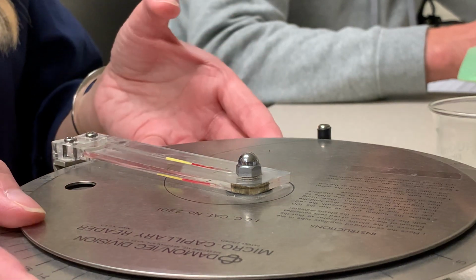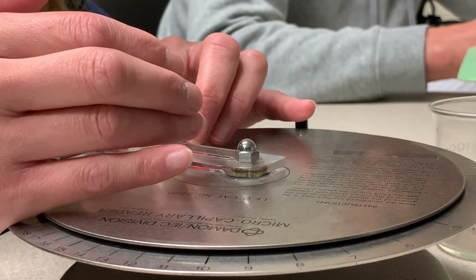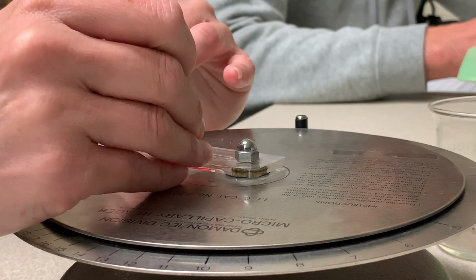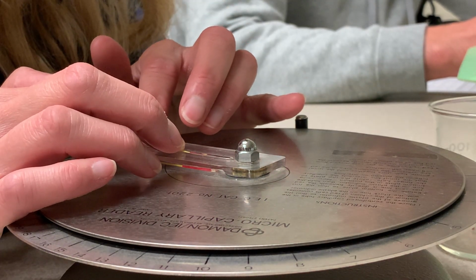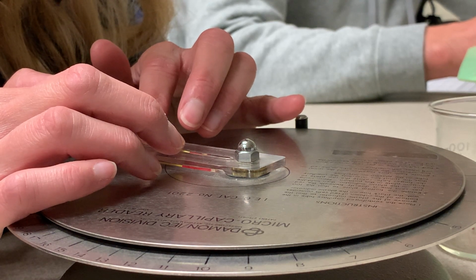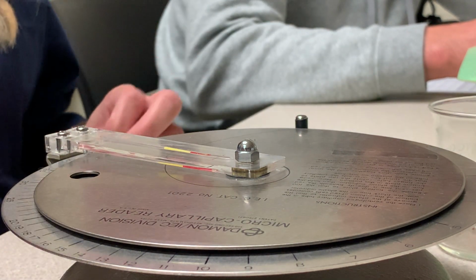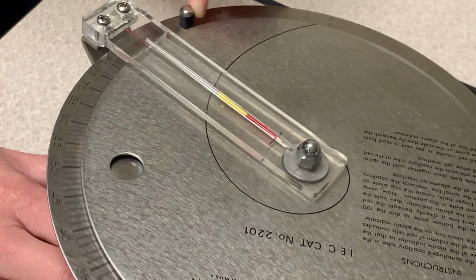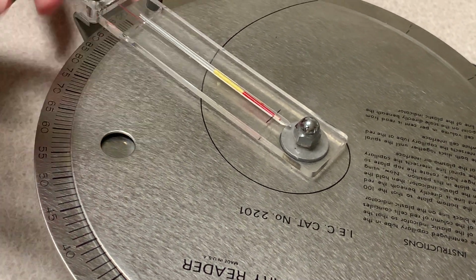The first couple of steps are calibration steps, basically. You want the ratio of the red, right? So you don't want the clay in your ratio. So first you want to put the black line between the red and the clay. You want to be right over it when you do it. And the second thing you do is move this so that it's at 100.